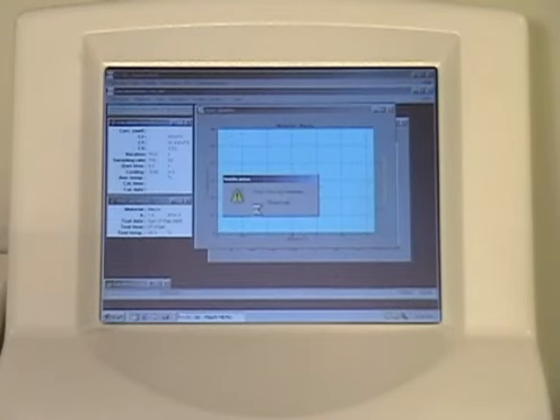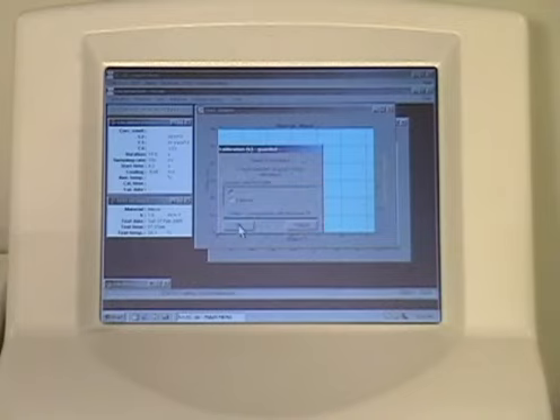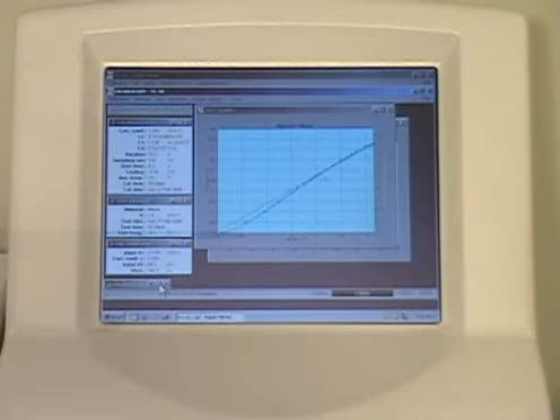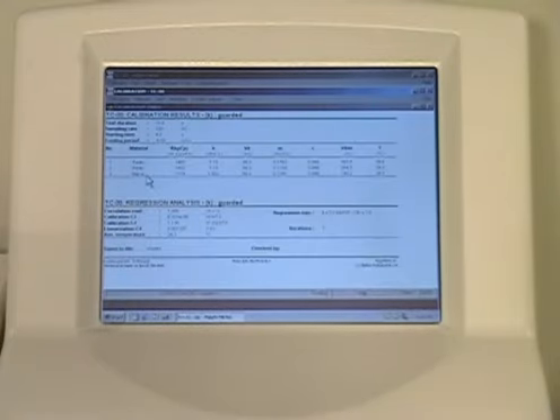After the 5-minute temperature stabilization period, proceed with your next reference measurement. The built-in calibration table displays the result from your reference test. Duplicate this one more time for reproducibility.